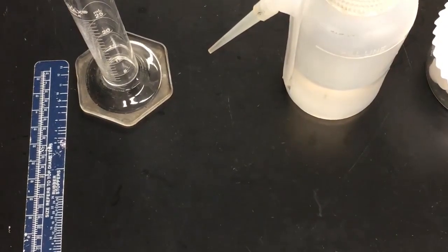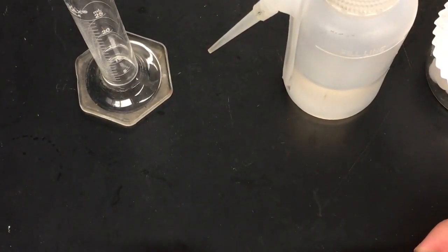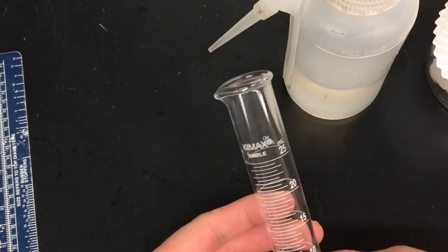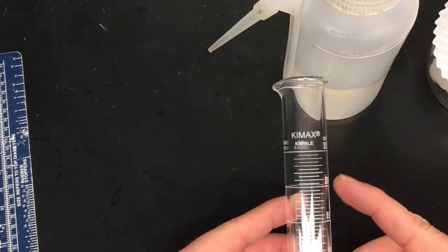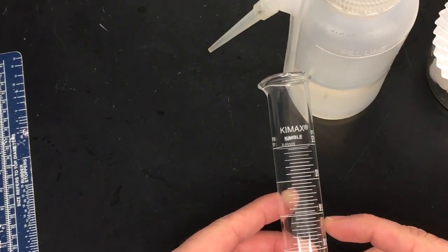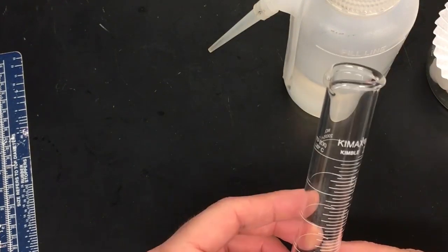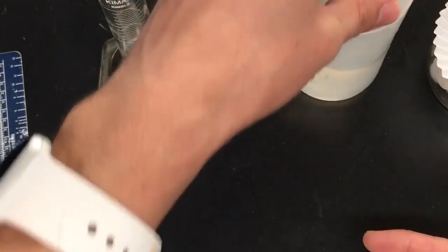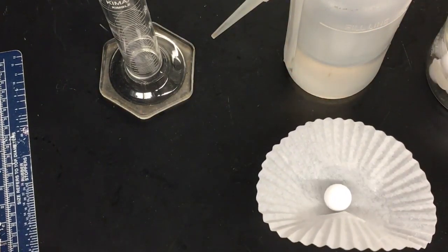All right, so it's a pretty simple experiment. All we really need is obviously a scale to get the mass, some sort of measuring device like a ruler. This is our graduated cylinder. This is a 25 milliliter graduated cylinder. I believe we have ones that are more precise, where we would have more notches per unit of milliliter. However, we needed ones that would also fit inside, so we could actually submerge the Teflon ball. A little bit of DI water and a squirter, and then of course our Teflon balls. Here's the one I massed earlier.